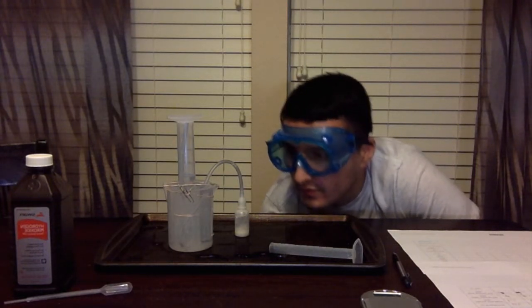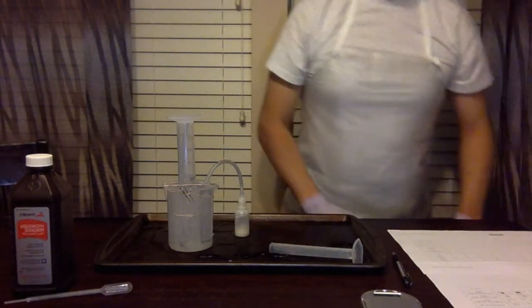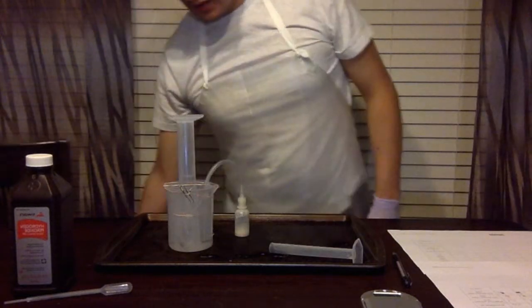36. 37. All right, looks like we have stopped at 37 milliliters.